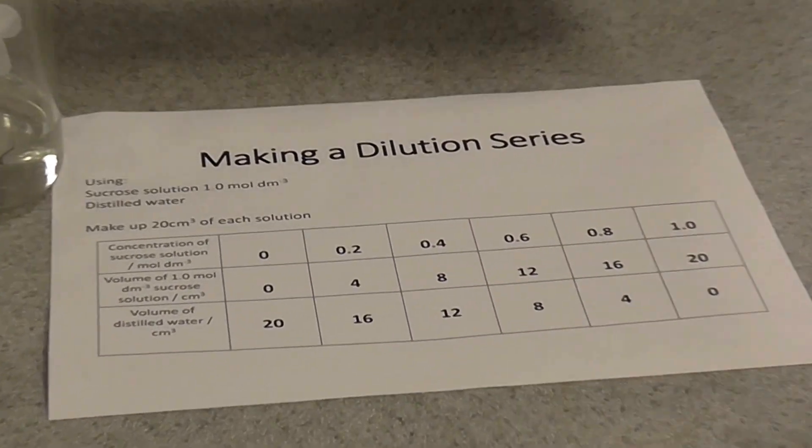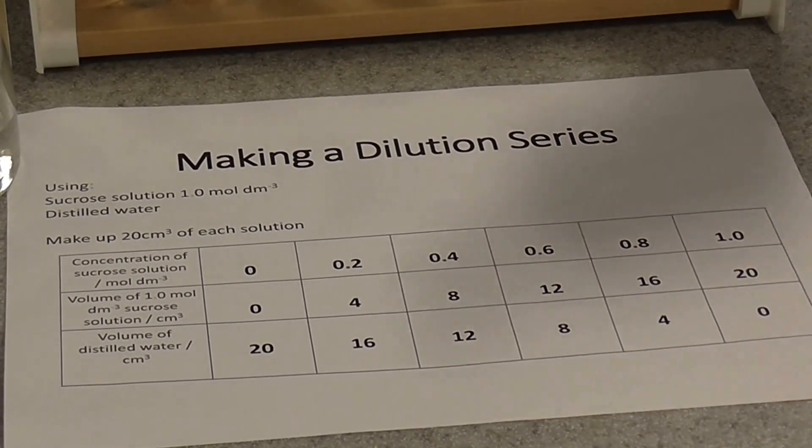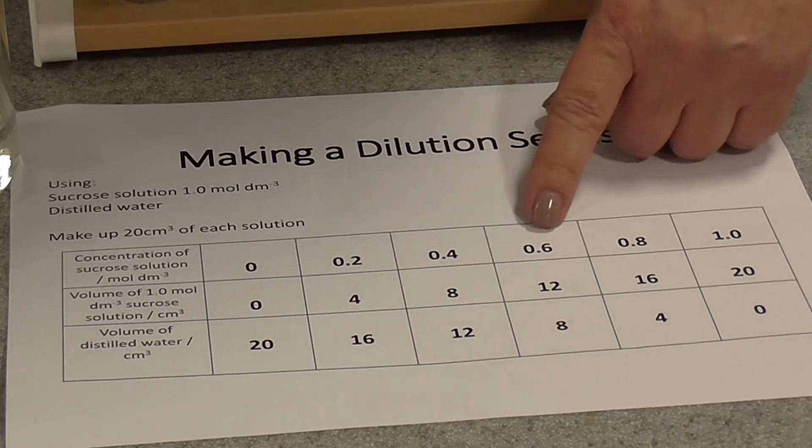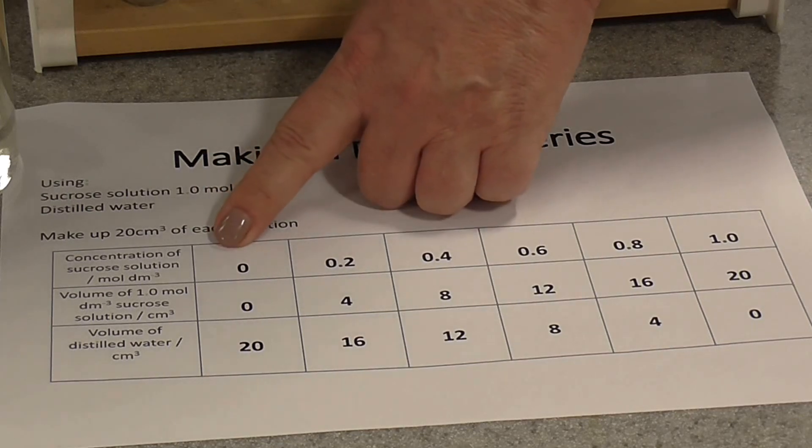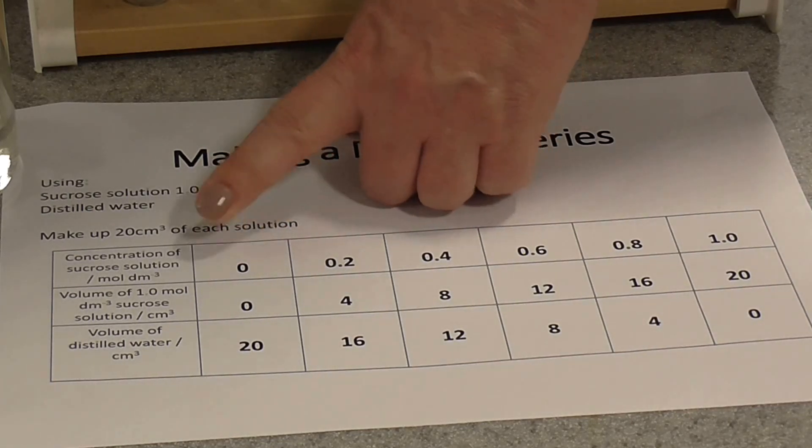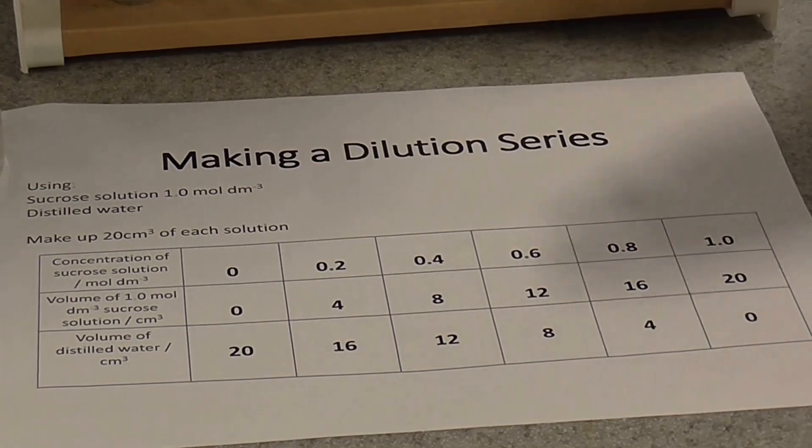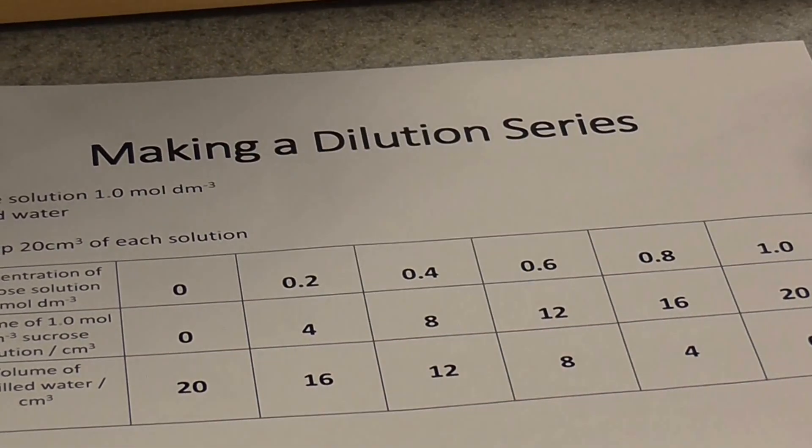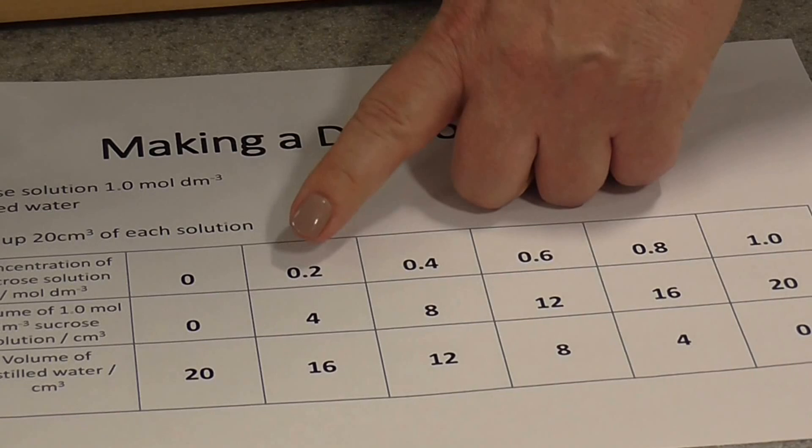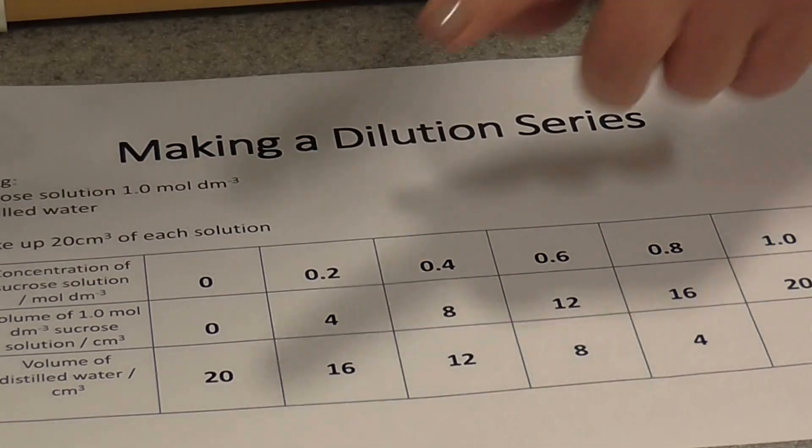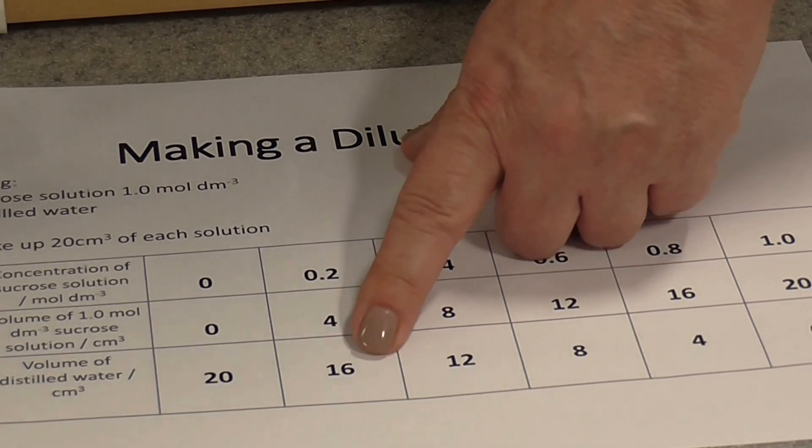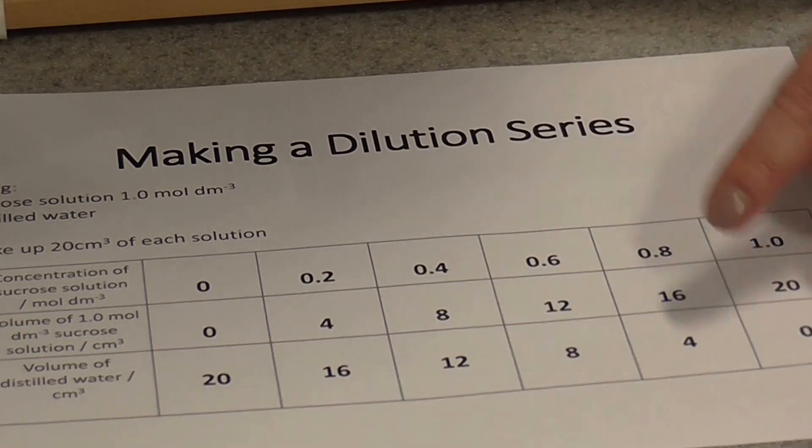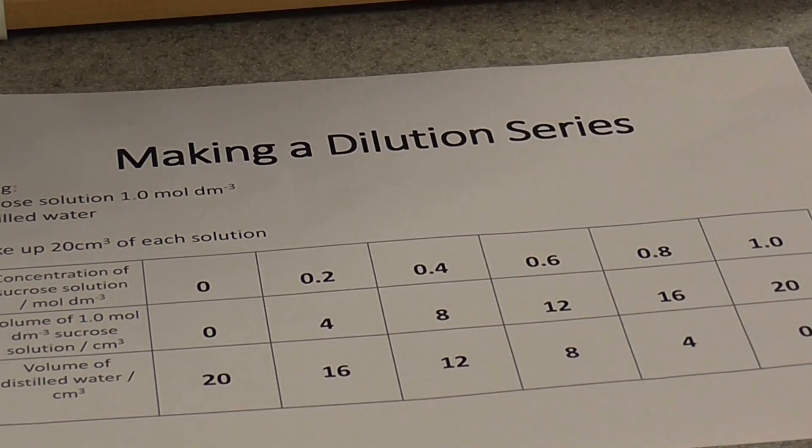First of all you'll need to label your test tubes. You see I've already made my dilutions here. These are the different concentrations of sucrose solution that we're going to prepare. To make 20 centimetres cubed up, the zero moles per decimetre cubed concentration of sucrose is just going to be water, so we need 20 centimetres cubed of water with no sucrose solution. Our 0.2 mole per decimetre cubed solution will need 4 centimetres cubed of the 1 molar sucrose solution and 16 centimetres cubed of water and so on. This table shows you how to prepare the rest of your dilution series.